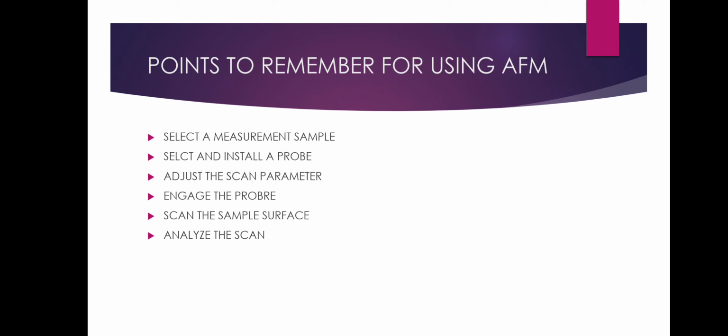Now the points to remember when we are using an AFM. The first point is to select a measurement sample. We need to check the sample before using the AFM, because if a sample is not suitable, then it might lead to damage of the tip, sample and piezoelectric scanner.